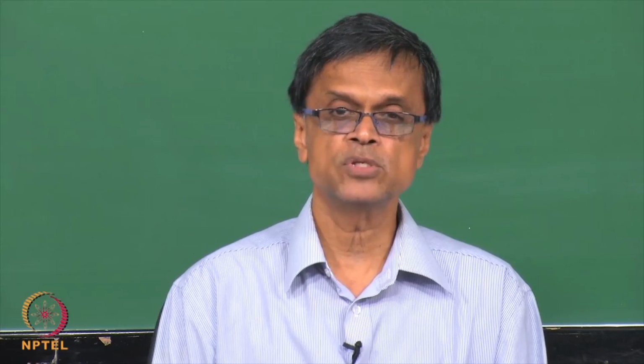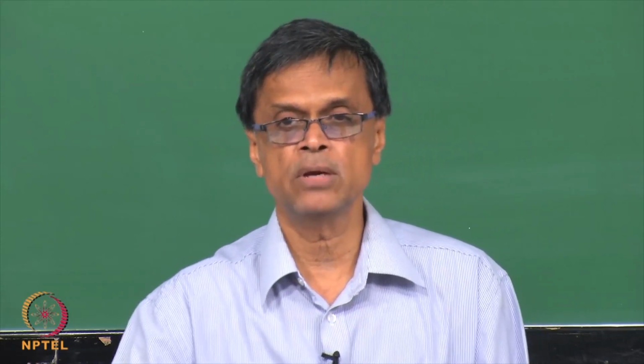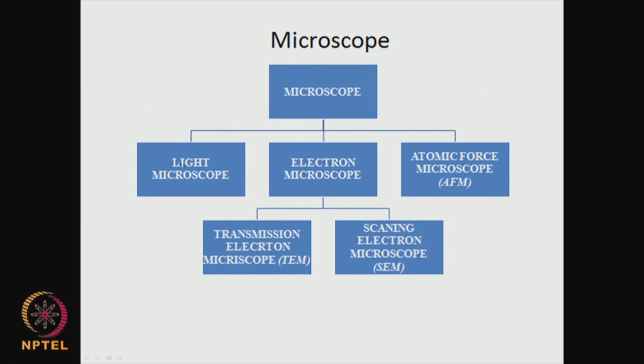The light microscope is used to look at biofilms. If you want to go deeper and look at the bacterial attachment, we can go into scanning electron microscope. If you want to look at nanoparticles or drug delivery systems, we use transmission electron microscope or atomic force microscope, because these have a higher resolution. We can go even up to 1 nanometer. The scanning electron, I would say about 20, 30 nanometers, maybe 100 nanometers.